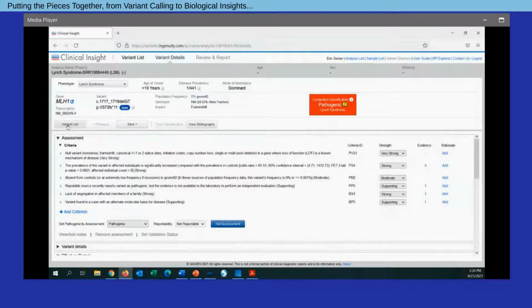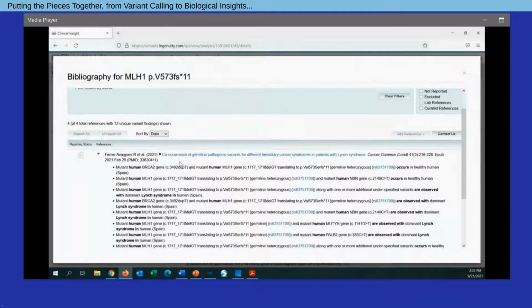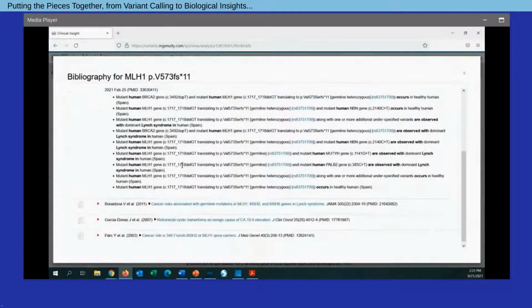And now I can look at the explicit criteria that were utilized to establish that this variant, in fact, is a pathogenic variant. For each of these pieces of evidence, we have an associated criteria ID, a strength, and for those pieces of evidence that tie into the literature, we'll also quickly be able to link out to a bibliography that has the associated reference information.